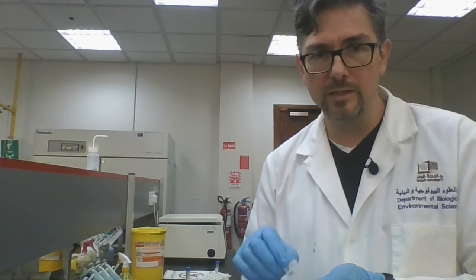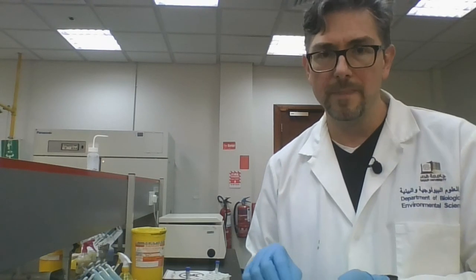So please just indicate to us on the tube which one has TE and which one has TER. This way we know which one we need to incubate for you for the 30 minutes. And then we will store the samples for you until next week, okay?